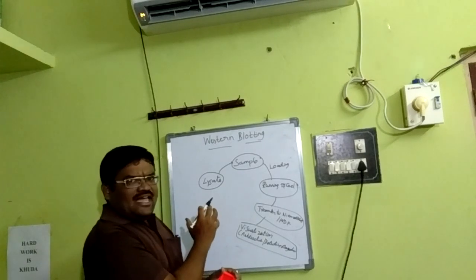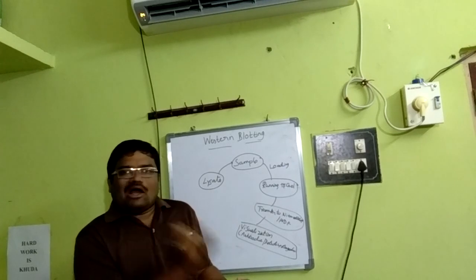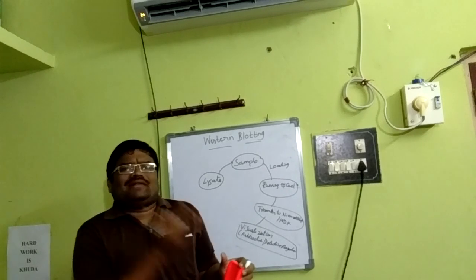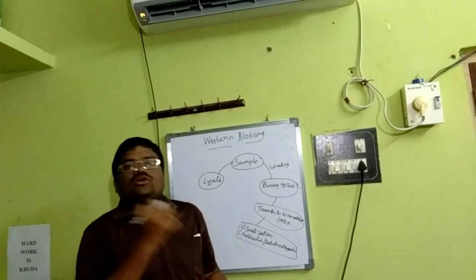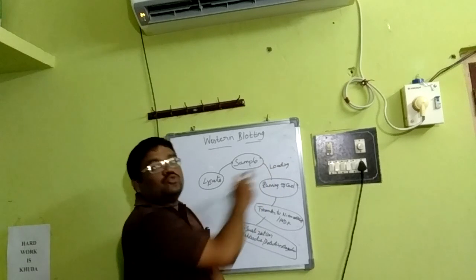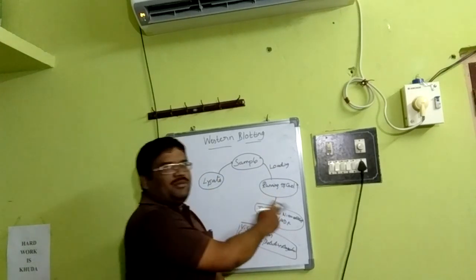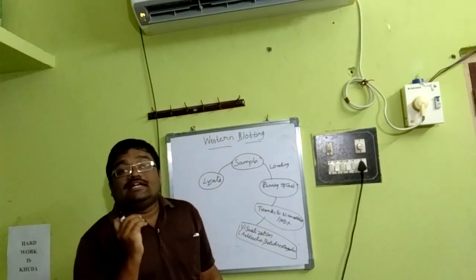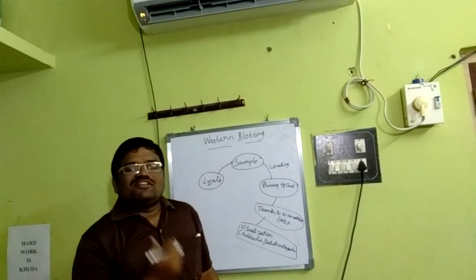First we have to prepare the lysate. I will tell you what exactly the lysate means. We have to break down the concerned target component, for example, a cell culture or a tissue. The word lysate implies breakdown, lysis, and the components coming out of the breakdown are the lysate. Then out of it we have to prepare the sample to be loaded, ready for the gel running. Then followed by the transfer to a nitrocellulose membrane or a PVDF. Then finally the visualization by specific antibodies and detective reagents.